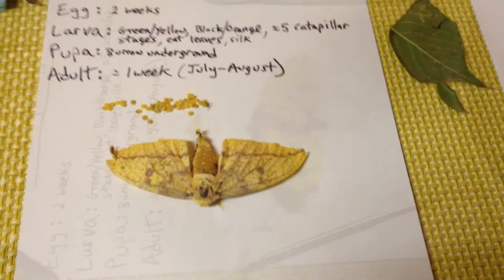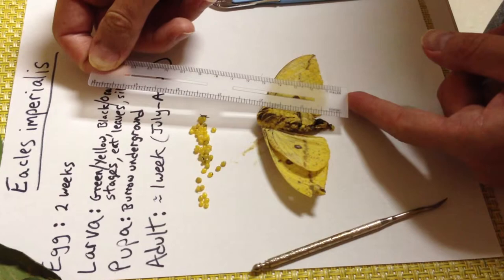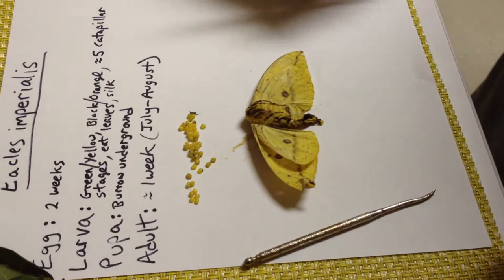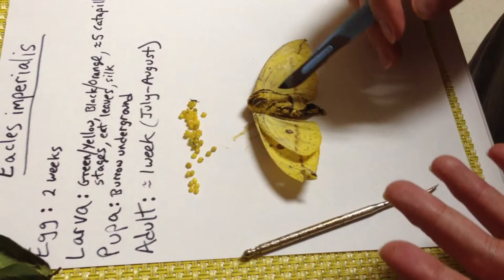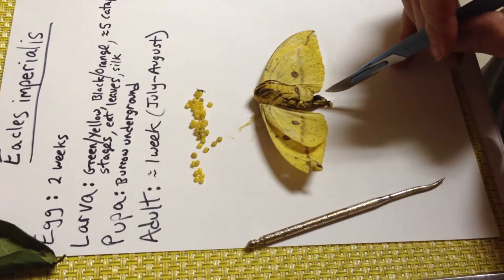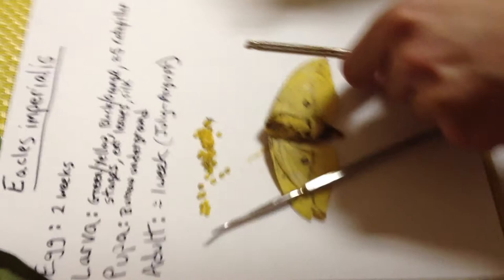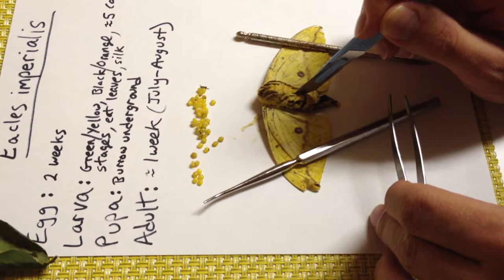Now let's take apart this moth. We have a ruler here — the wingspan is about four and a half inches wide, the body is about two inches. This is the underside — I don't know if this is the proper term for insects, but this is maybe the ventral side. I'll just make a cut down the middle to see if there's any more eggs inside. I'll support the wings with these tools and just go down the middle — it's very soft.